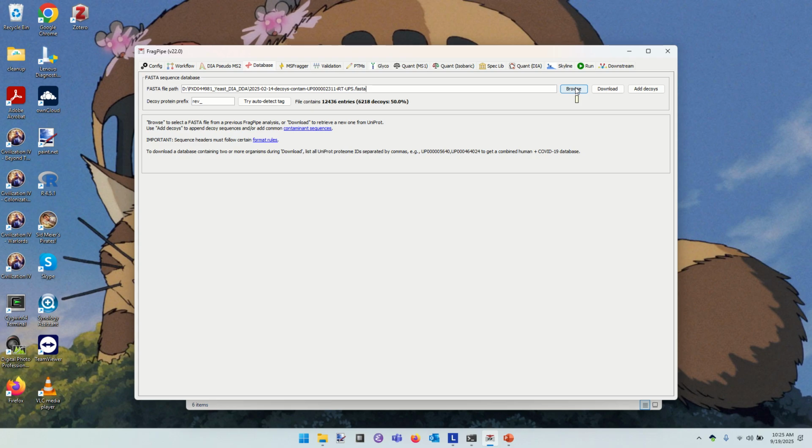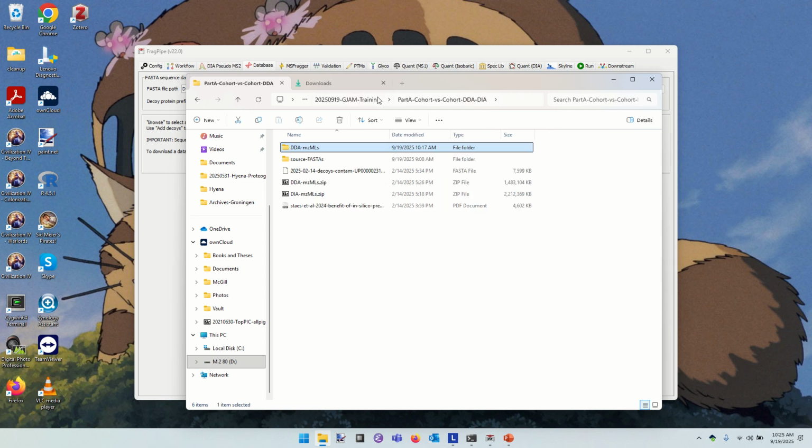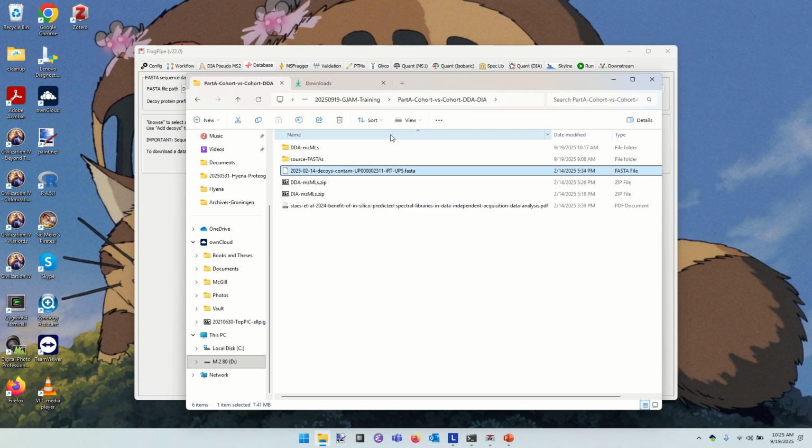We don't consider the space of all combinations of amino acids. That's way too big and nasty a space. Instead, we're going to consider just the protein sequences that are in yeast or in the human spikes. If we return to the files that we copied from the thumb drives, you should see something right here that is a FASTA file.